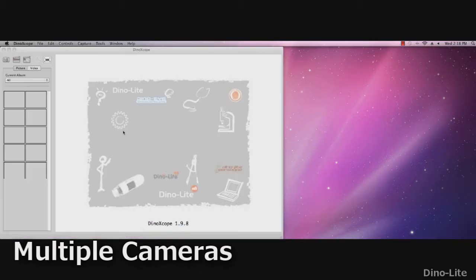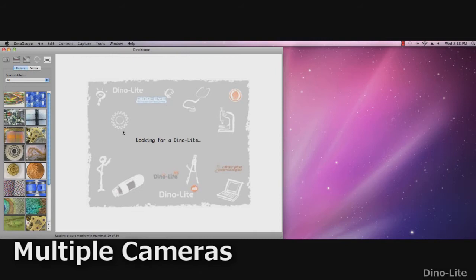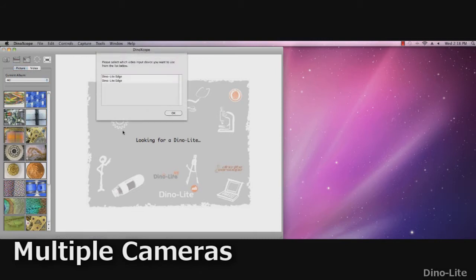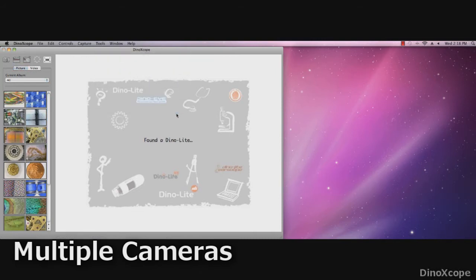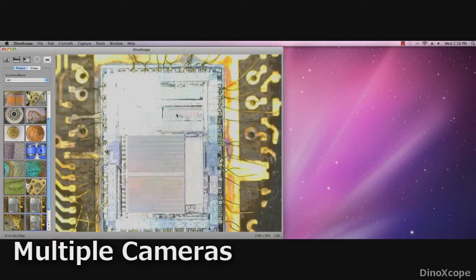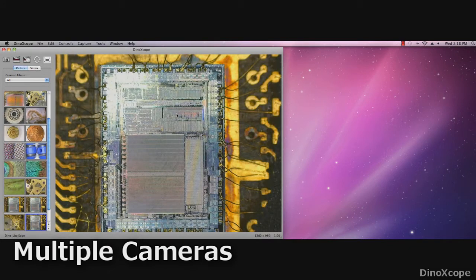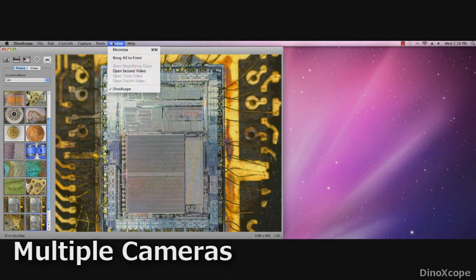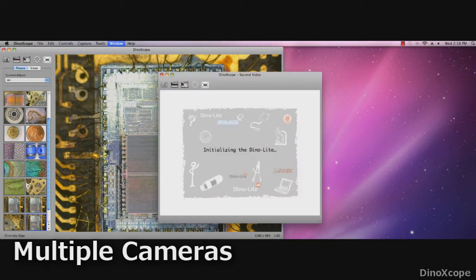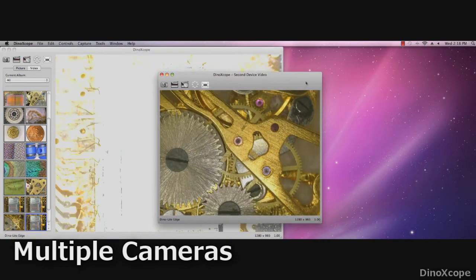When more than one DynoLite is connected to the computer, users can select which camera they want to view. To view any additional DynoLite, simply go to the window menu and select open second window and the other DynoLite microscope camera will appear in a second window.